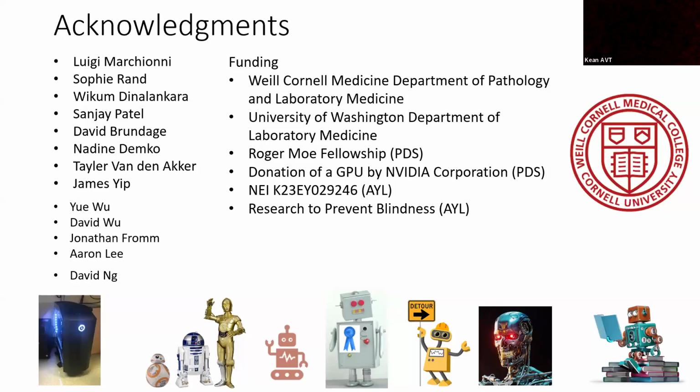Hi, great presentation and a comprehensive overview of most of these things. My question is, on a day-to-day basis, the fluorescence shifts, right? You know this. How does the CNN get used to this or normalize this or deal with this when it makes its prediction?